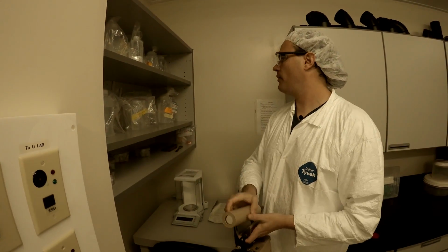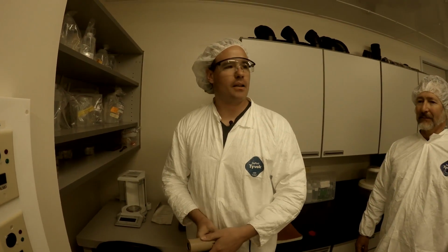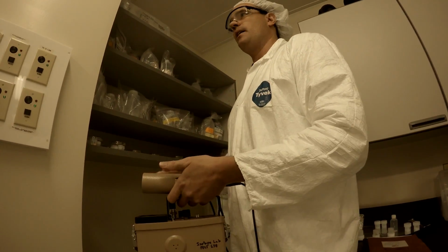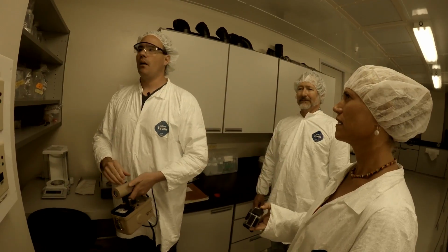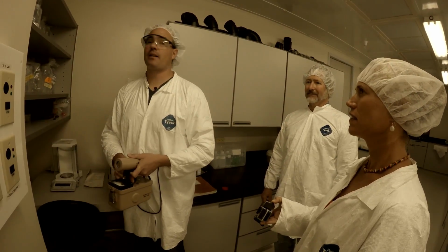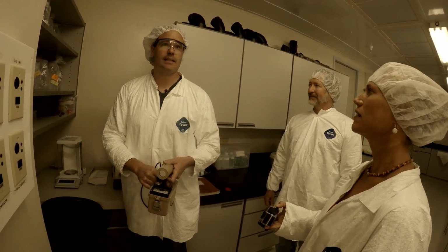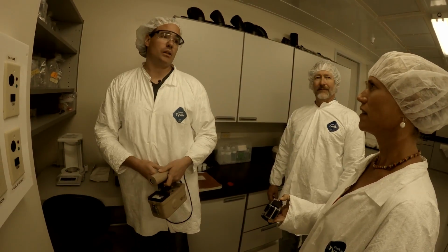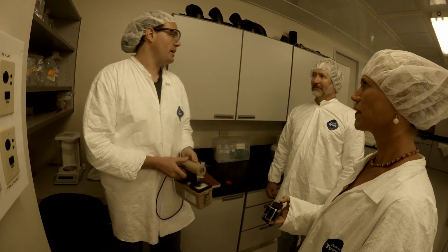But when you work with radioactive spikes of uranium, for example, the Nuclear Regulatory Commission likes to keep very, very close track of that. And so that is why we do it, not because we are looking at radioactive contamination of samples or anything like that, but just because if you want to work with these materials, those are the rules you have to follow. That's just the way it goes.